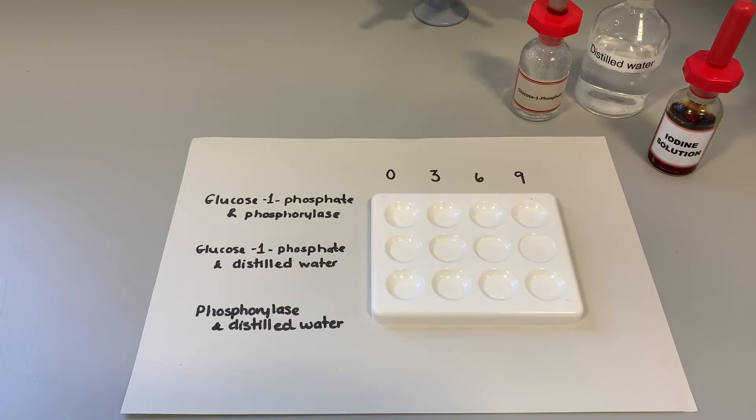Then the second row has got glucose 1-phosphate and distilled water. That's what we call a control. That row is there to prove that glucose 1-phosphate does not turn into starch all by itself. It's the presence of the phosphorylase that's doing that. The reason that we add water is to keep our experiment valid because we're adding a volume of a substance that we know will have no effect.